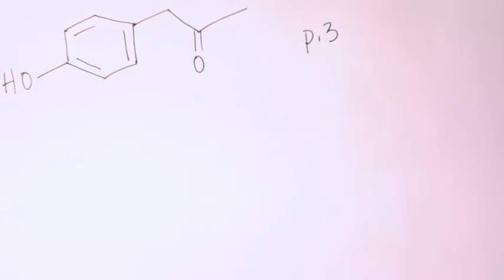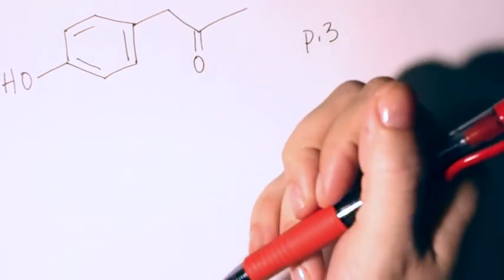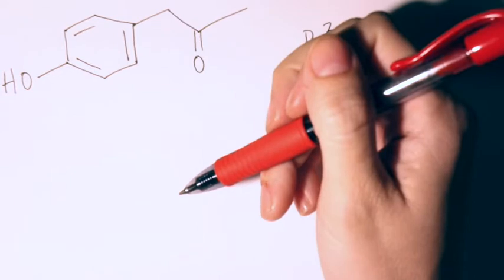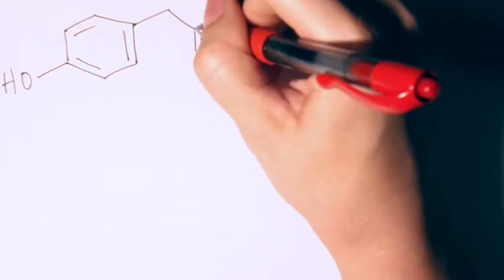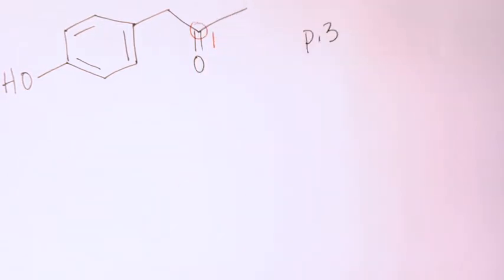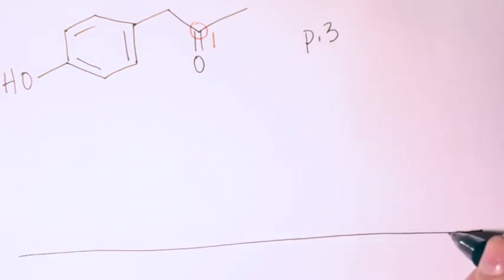So anyway, we're going to go through it and figure out what's going on with the carbon NMR. This is our first example where we've seen an aromatic compound, so this aromatic ring is going to show up in our NMR spectrum, but we have some familiar carbons. We have this guy here, another carbonyl. That's the one that's going to be way downfield, around the 180 to 200 region.